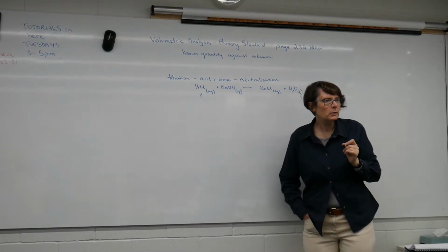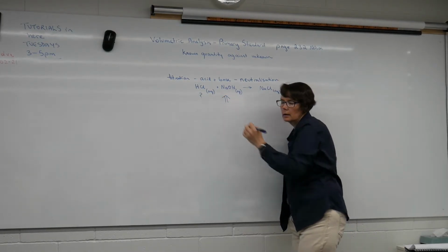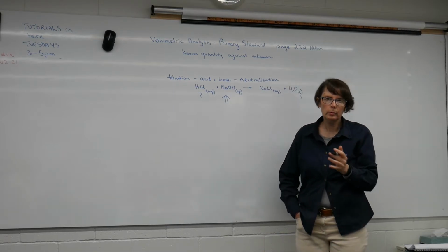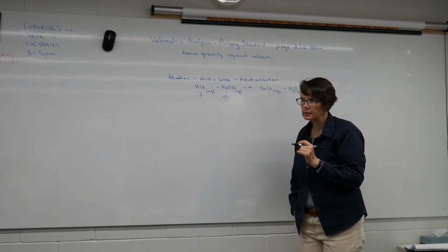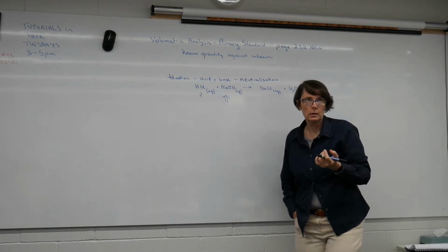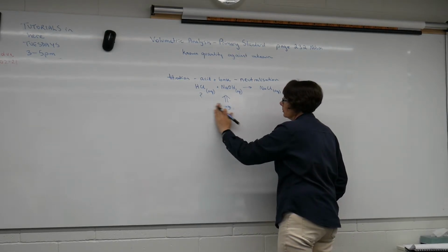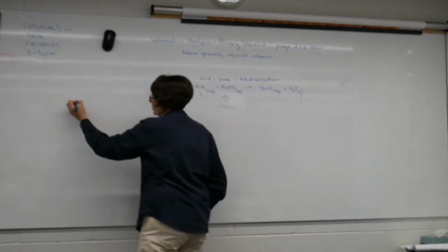So that means that we have to know this one, don't we? Well, the problem with sodium hydroxide is it's not stable. It's hygroscopic.